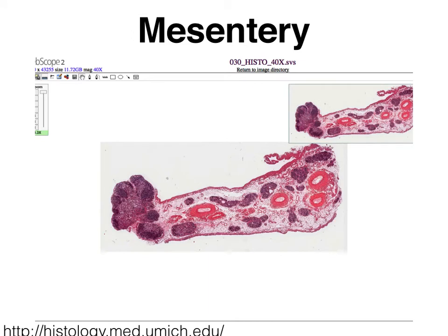To study the simple squamous epithelial tissue in mesothelium, we're going to take a look at a slide that is titled mesentery. Here we see a sliver of mesentery, which is really the structure that interconnects the many coils of the small intestine, for instance. It is very vascularized, which is why you see lots of reddish circles. And there are lots of little lymph nodules — these are the darker structures that you see. And amidst the blood vessels and the lymph nodules, we have quite a bit of fatty tissue.